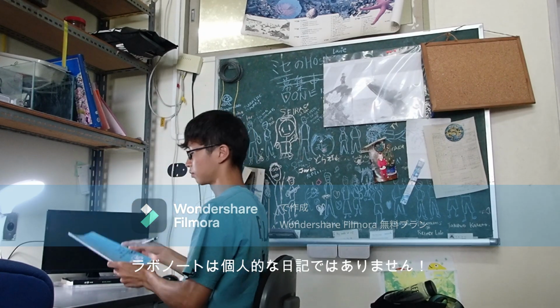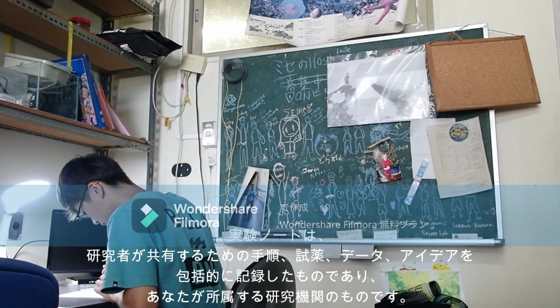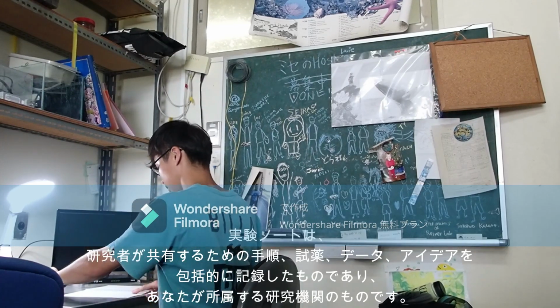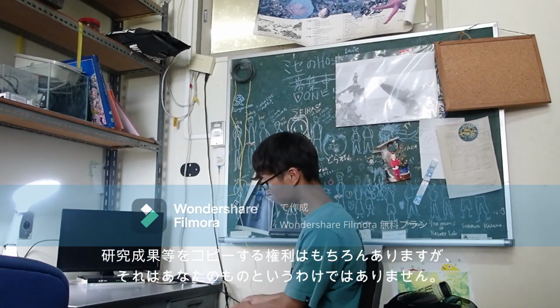A lab notebook is not a personal journal. It is a comprehensive record of procedures, reagents, data, and thoughts for researchers to share, and it belongs to the institution for which you work. While you have the right to make photocopies of your work, it is not yours.